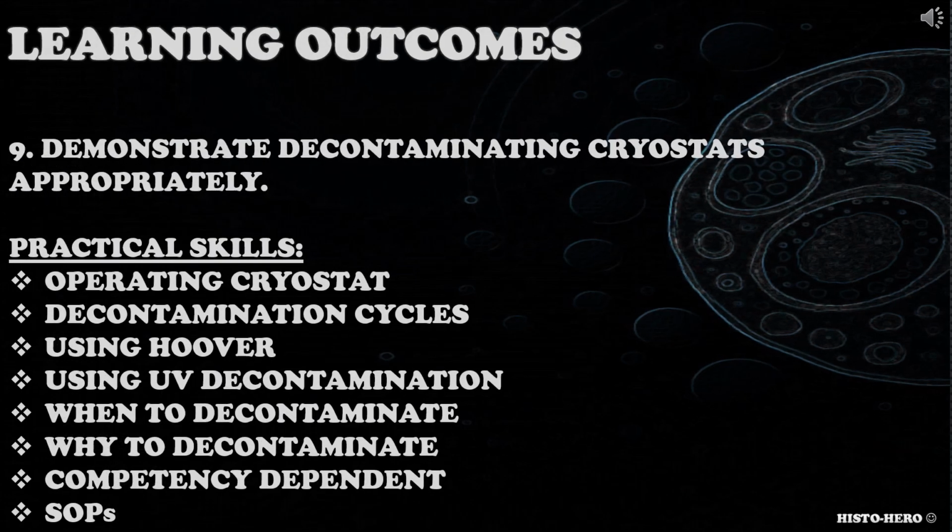The ninth learning outcome is for the candidate to demonstrate decontaminating cryostats appropriately. How would you decontaminate a cryostat? Consider your practical skills in operating a cryostat, UV decontamination, monthly decontamination, hoovering, the importance of when to decontaminate and why, following the SOPs. This again is highly competency dependent.